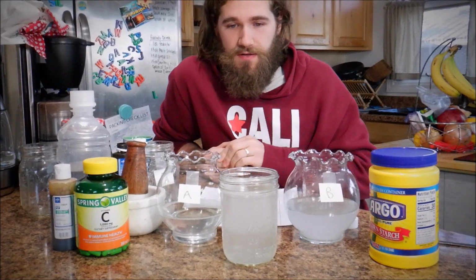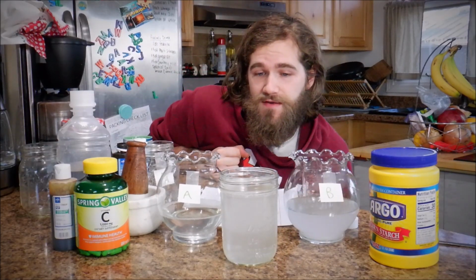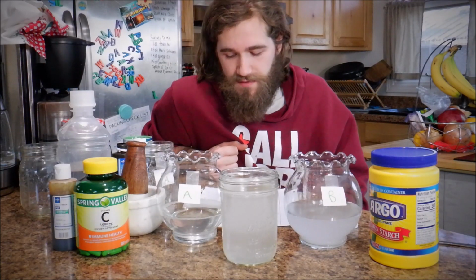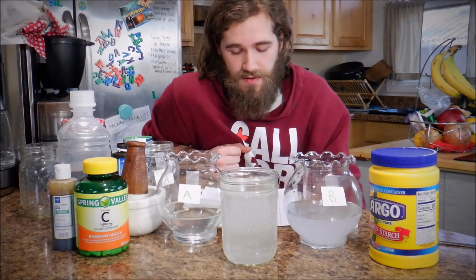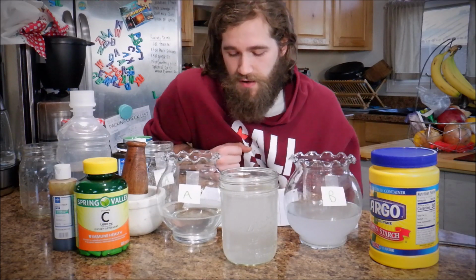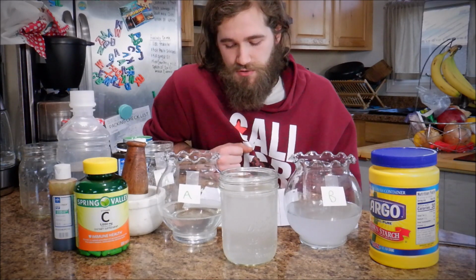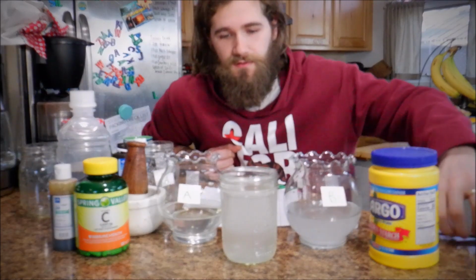And then additionally, the ascorbic acid is going to be consumed because we added excess hydrogen peroxide in solution B. So that will happen as the I2 begins to accumulate. And then hopefully the I2 complexes with the I negative to form triiodide, which complexes with the starch, and then should leave us with triiodide and starch. We can try to help agitate it a little bit.